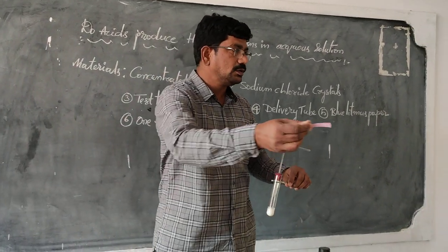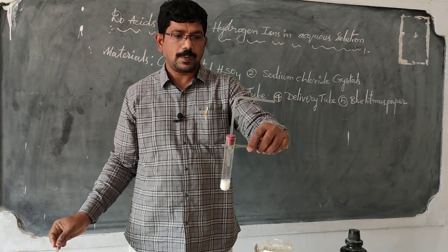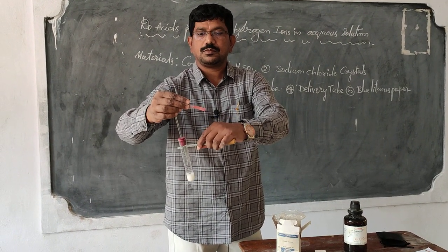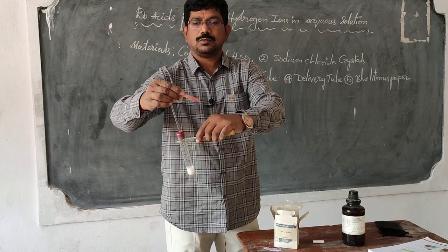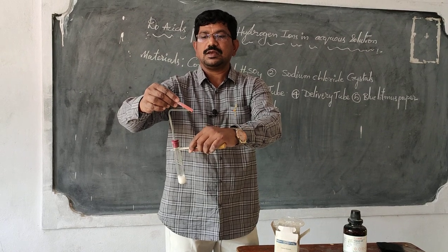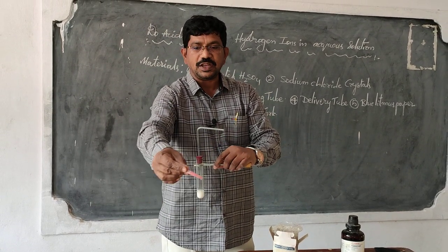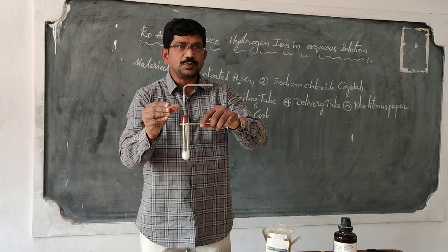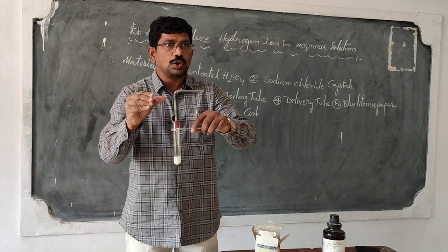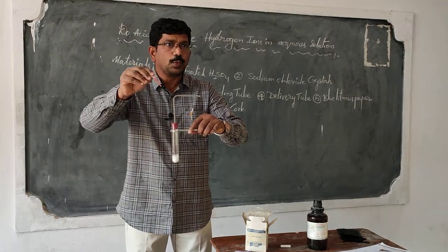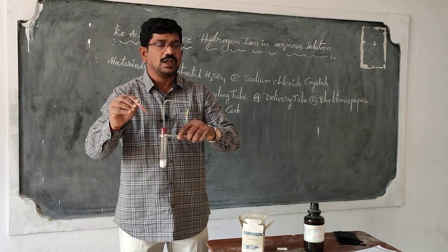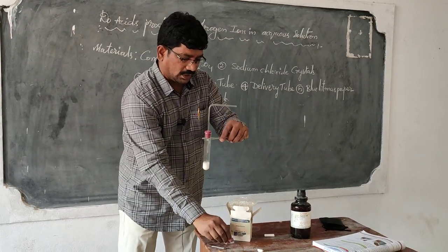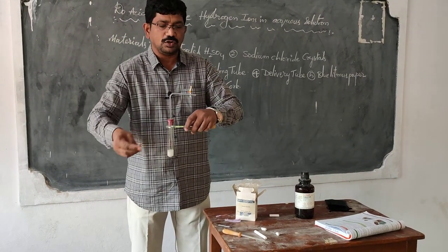Now give me one or two drops of water. Do you find the fumes of HCl? What happened to the litmus paper — do you find any change in it? Yes, sir. What is the change? Red color! So the gas produced during that reaction is HCl. Sodium chloride reacted with concentrated sulfuric acid to produce dry HCl. When you test the dry HCl with blue litmus paper, there is no change in color.